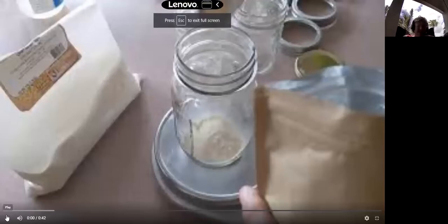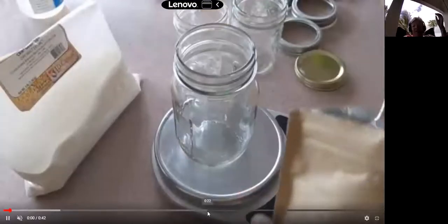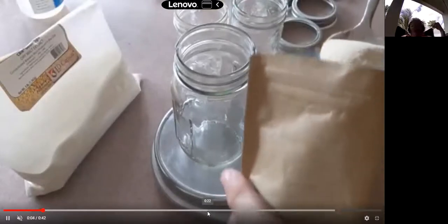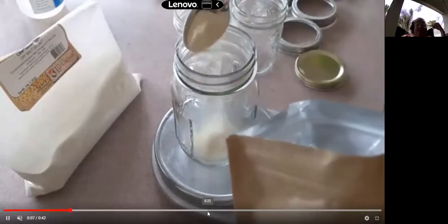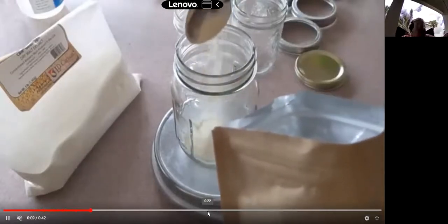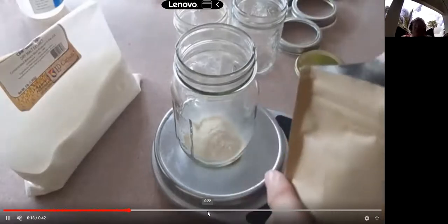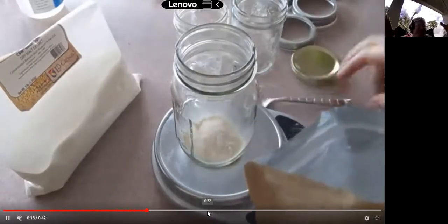So here we go. If you are setting up agar, you follow the instructions on the package. You buy the agar on Amazon. And generally it's so many grams per liter. You will never need a liter of media. I generally do it in the 100 ml range.